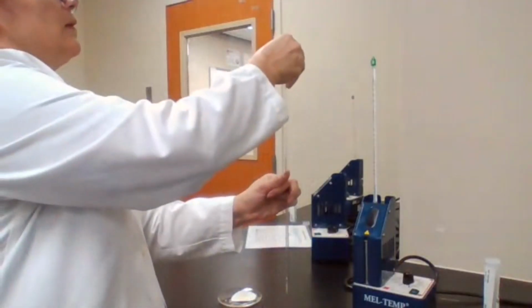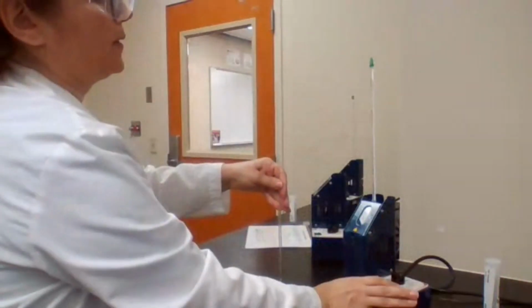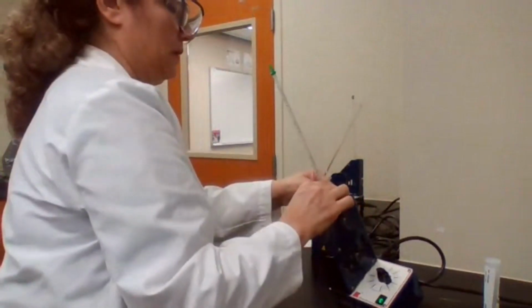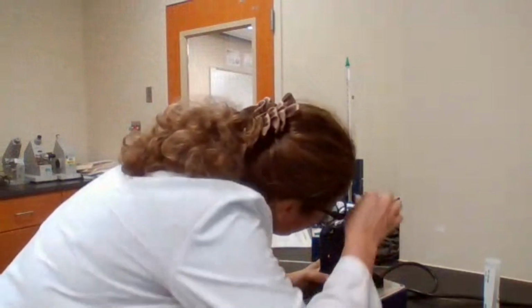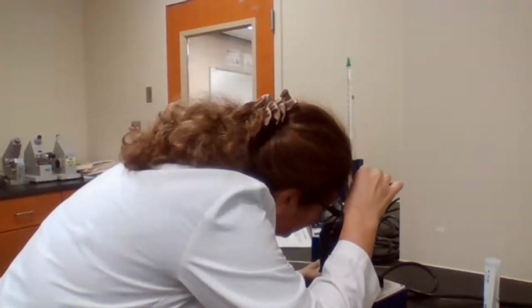Okay. Going to prepare the sample. Use a capillary tube. Capillary tube, pass it through the whole glass tube. Placing the sample. And monitor.